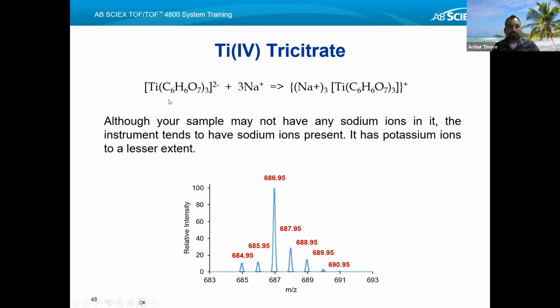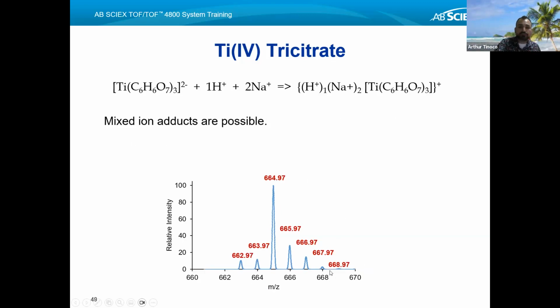And so here I have a representation of the titanium tricitrate with 3 sodiums forming this adduct, this +1. Okay? And that +1 can be detected by the positive ion mode. And then you see the corresponding theoretical mass spectrum, and the corresponding isotopic distribution. And again, the separation of the peaks is a measure of the charge.